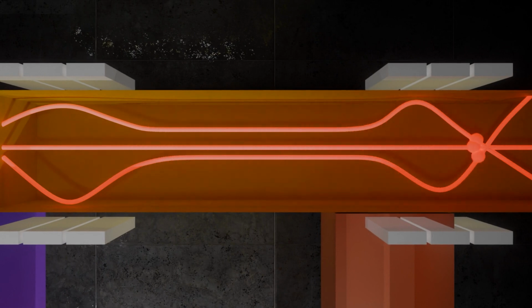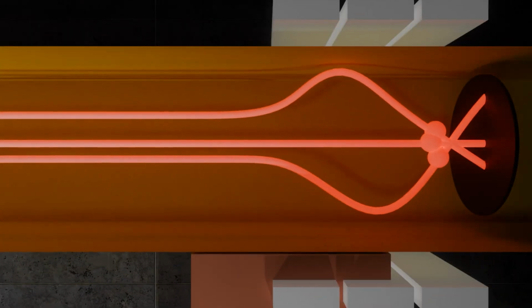Then after that, the other lens focuses them onto a point, and then past that point it hits the detector, and there. That's all for our setup. And I know it was a real awful lot, so let's go through it all again, this time in a bit more strict and linear way.